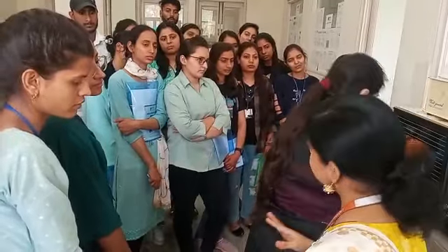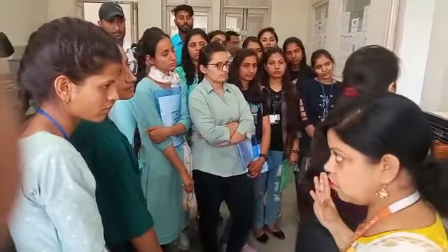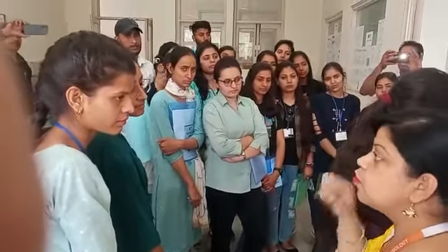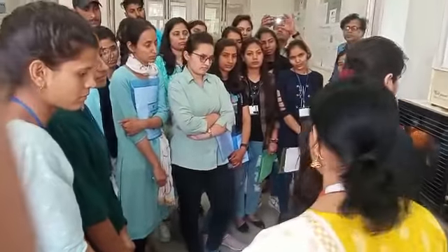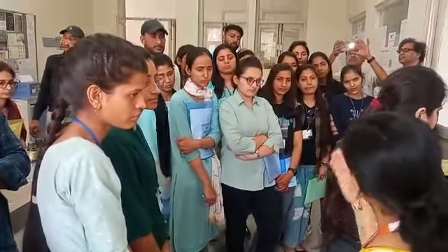If your reaction is completed, it means you will get a single spot on the thin layer chromatography plate. Okay, there is not any impurity present in that spot. Spot means you are checking the RF value. What is the meaning of spots? You are checking the retardation factor of every reactant. Understood? There is a different RF for benzaldehyde.